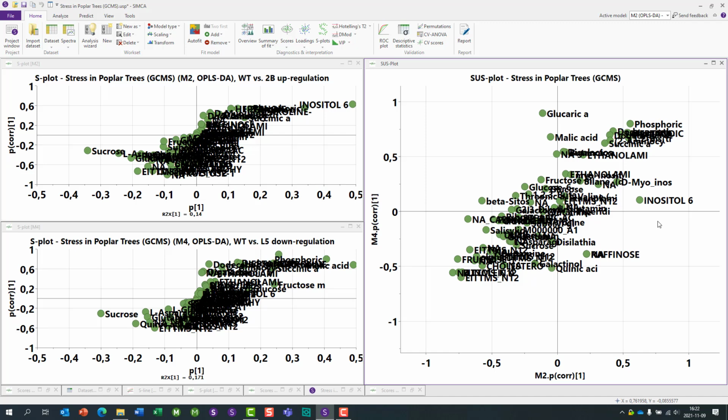And conceivably, you could also with SIMCA illustrate a five-class comparison where the five classes are compared with the same reference class. If you have a three-dimensional SUS plot, you use colors to represent the fourth dimension or the fourth scale, and you use sizing of the plot markers to represent the fifth dimension or the fifth aspect.